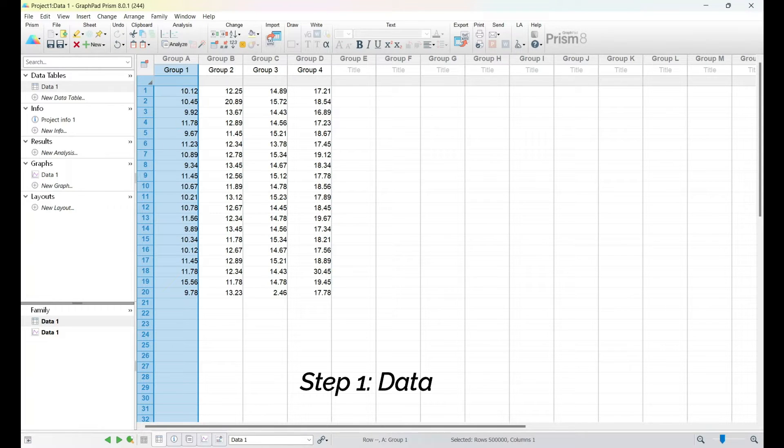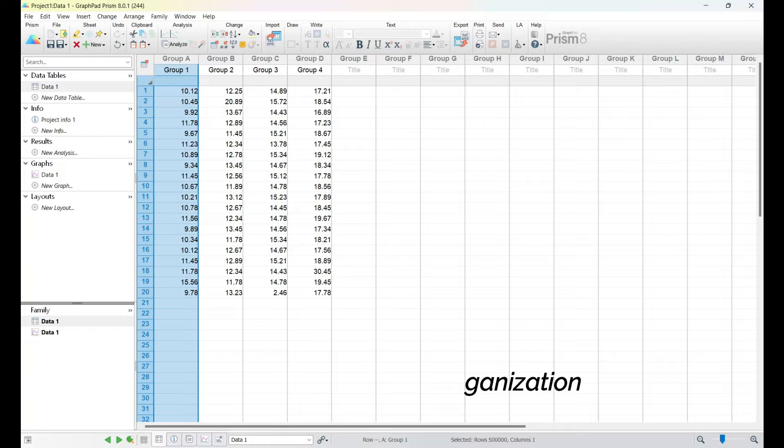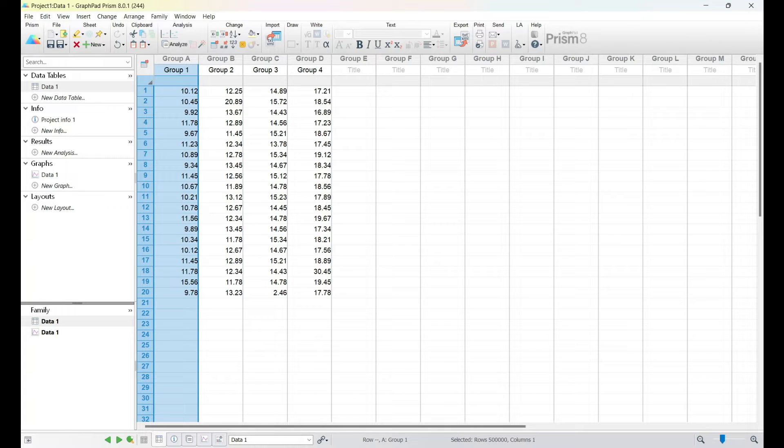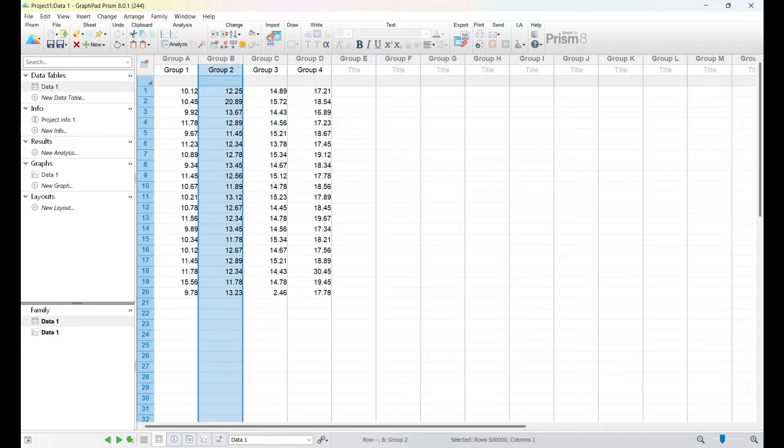Before we jump into the analysis, it's crucial to have well-organized data. In GraphPad Prism, you can easily input your data set by clicking on the Enter Data tab. Here, you'll create four separate data tables for each group.